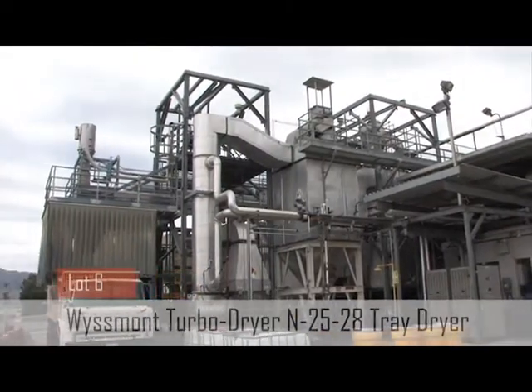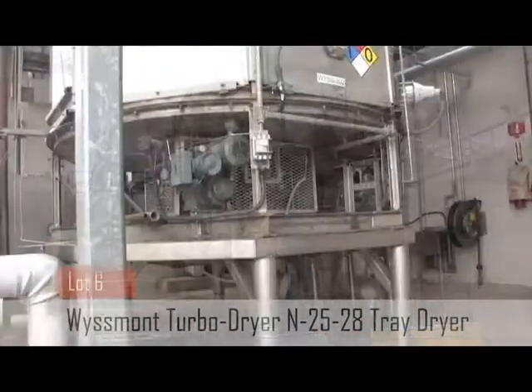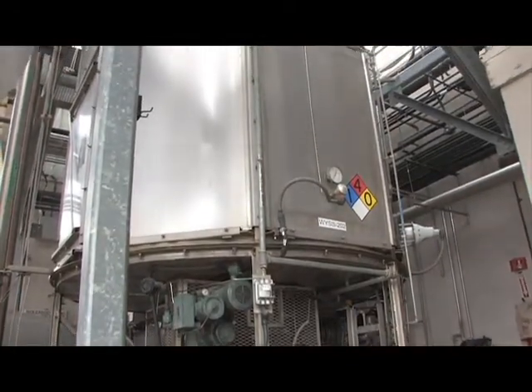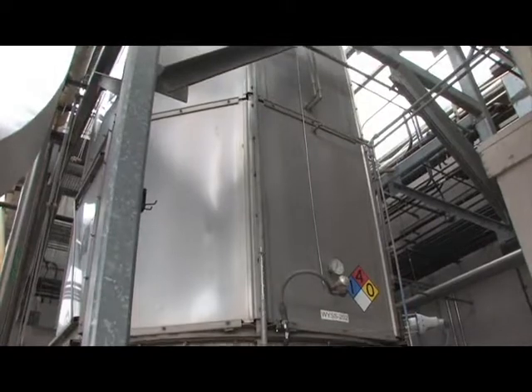Wisbon has a solvent recovery addition, which is a solvent condenser and storage tank. It is designed to provide gentle drying to retain nutrient levels and markers and product integrity.